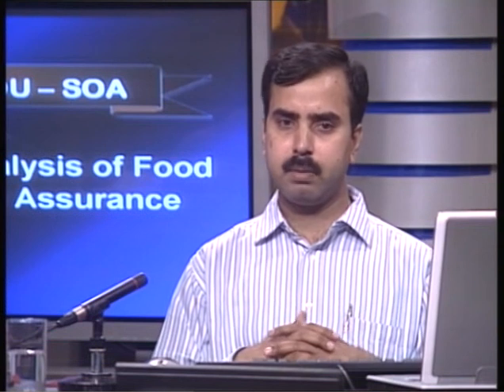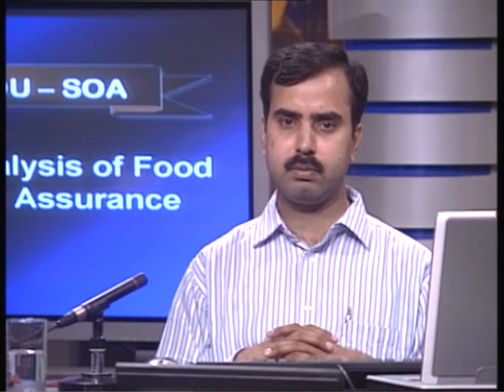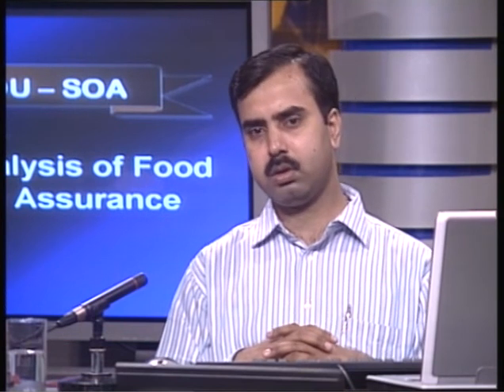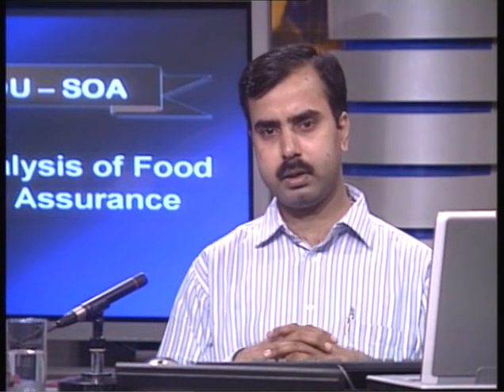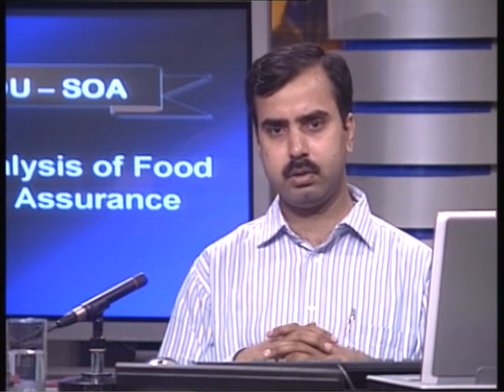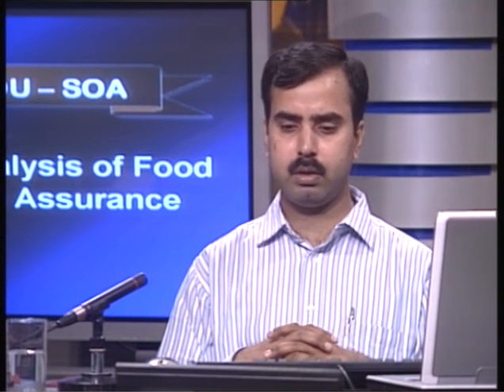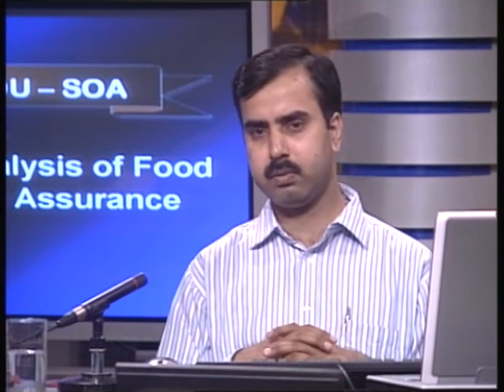Then there is a pump. The pump is required to carry the mobile phase from the mobile phase storage to the column. While going to the column, it takes the sample or standard injected through the injection module, and the sample or standard along with the mobile phase goes to the column, and it gets separated over there.